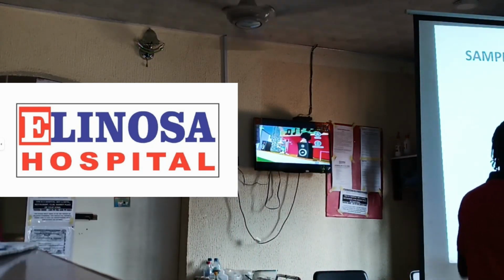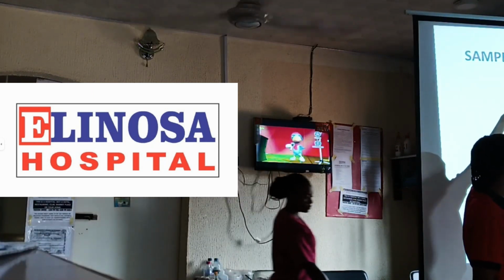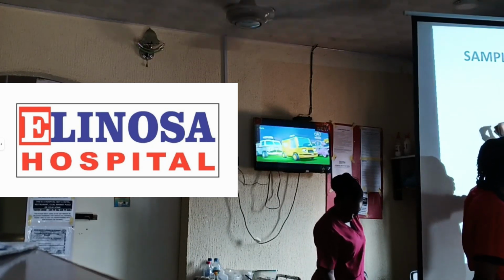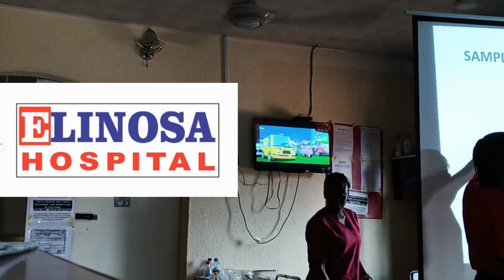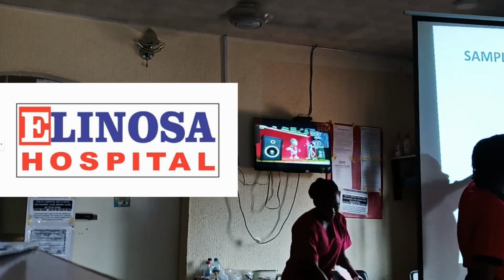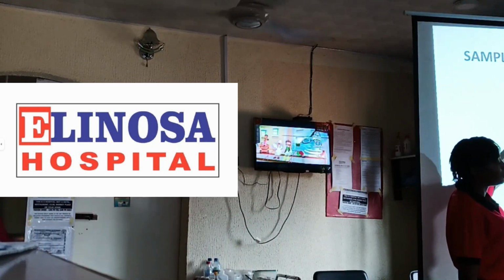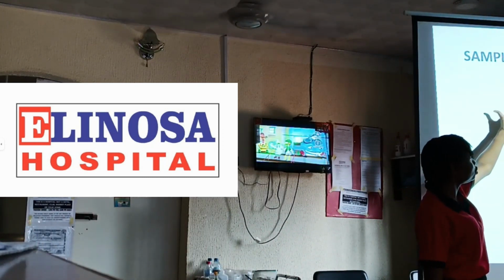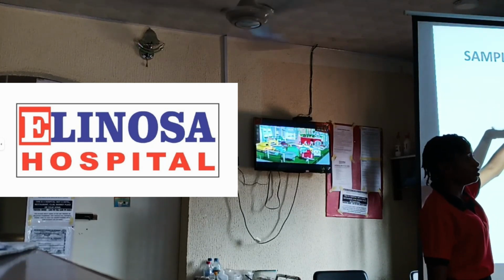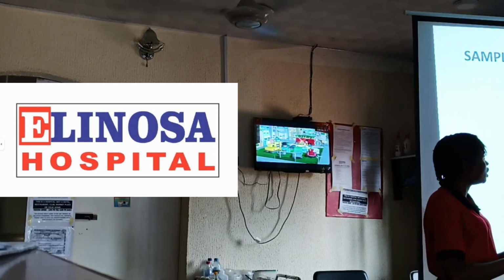Okay. So let me use this container. It is showing a sample collector container containing blood. So by the time you collect blood into your sample container like this, you don't have to put it inside the fridge. And this other one is showing a tissue, like maybe your skin tissue, or even the liver, any kind of organ or tissue that is harvested in the theater.